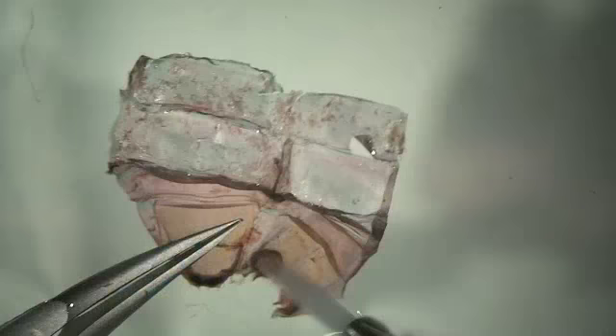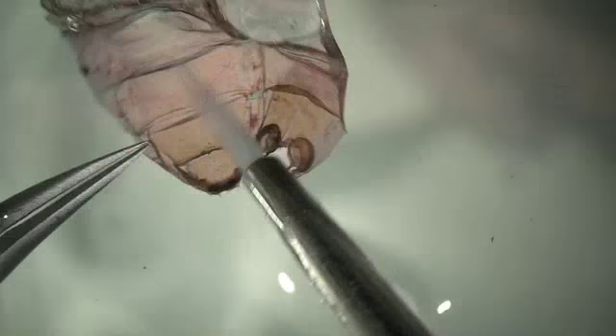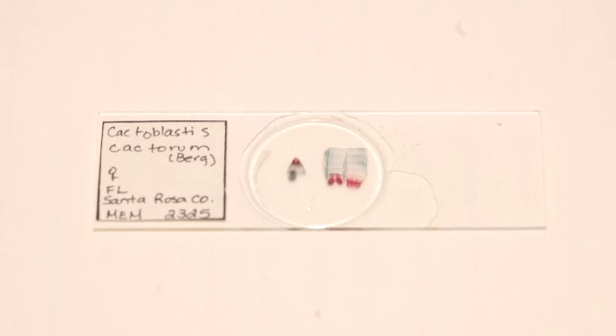The abdomen and genitalia are given a final cleaning before being placed under glass chips in 100% ethanol for positioning the parts and hardening. The slide is made with the same method used for male dissections and labeled accordingly.